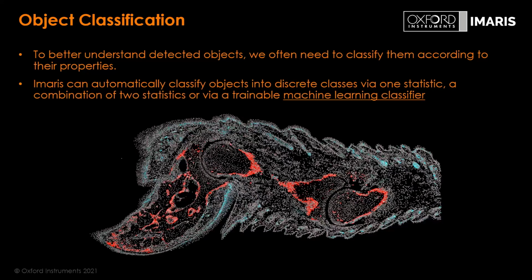We have different cells here, and each of those white dots, and it's very tiny, represents a different cell type. Okay, so we have just used the spot object to maybe get a count, but just place and label every one of those cells. And now we do want to label them. We do want to classify them based on the cell type. Okay, so we want to say a few of them are cell type A, cell type B, cell type C. But there are so many of those. I mean, you could theoretically just paint and assign all of them manually, which is a lot of work. Or you can use machine learning classification where you paint a few of them. Like here you can see a little bit of red here, maybe just a little bit here, a little bit green.